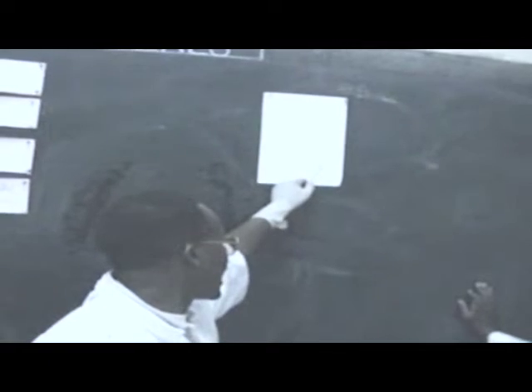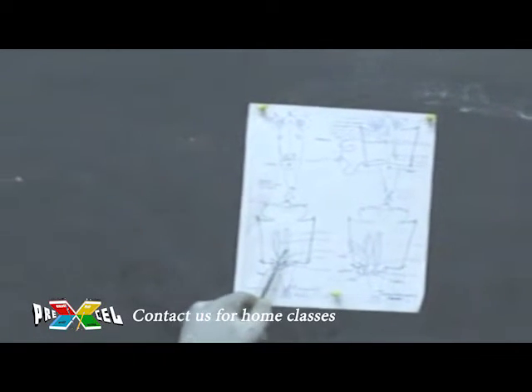These are the urinogenital systems of a female. You dissect and place like that, then draw a diagram. You have the ovaries containing so many eggs and these are the kidneys. If it were a male, you would be able to see the testes. The testes are also as long as the ovaries but they are very small and whitish in color — not as big as the ovaries containing eggs.